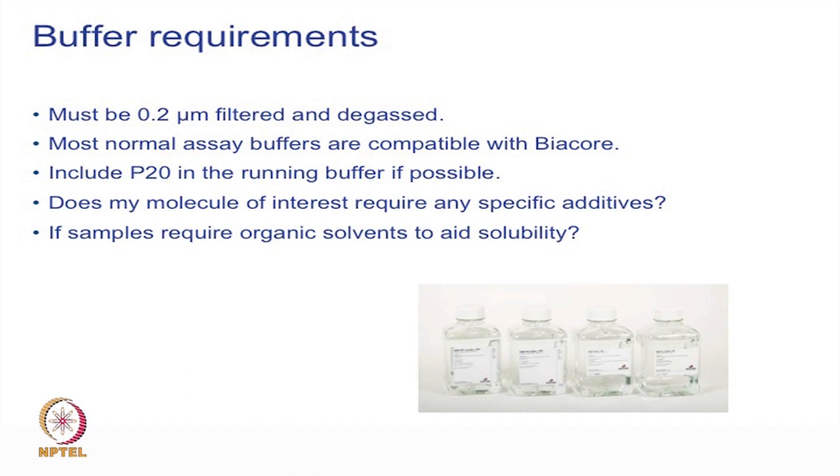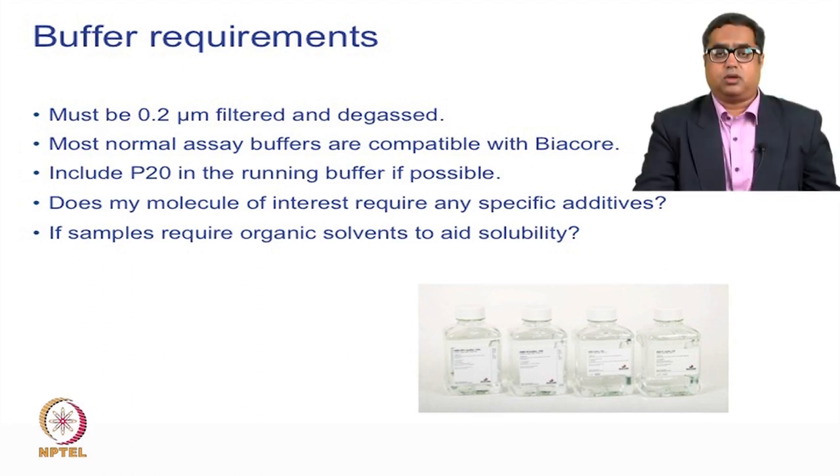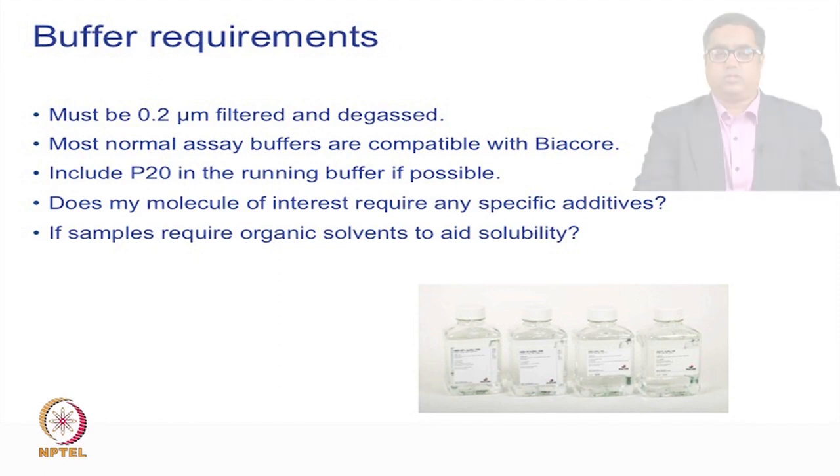Sometimes some additives are especially required for your running buffer, like metal ions or other activating molecules, activators. All these need to be added into your running buffer or sample buffer to maintain conditions for your experimentation. And sometimes when we filter and degas, we need to check for the proper filters which are compatible with water and organic solvents.